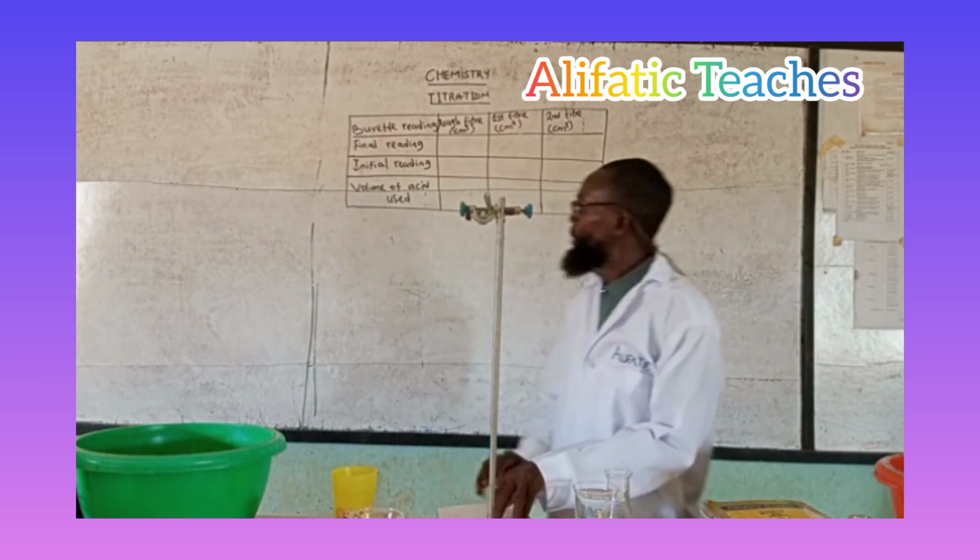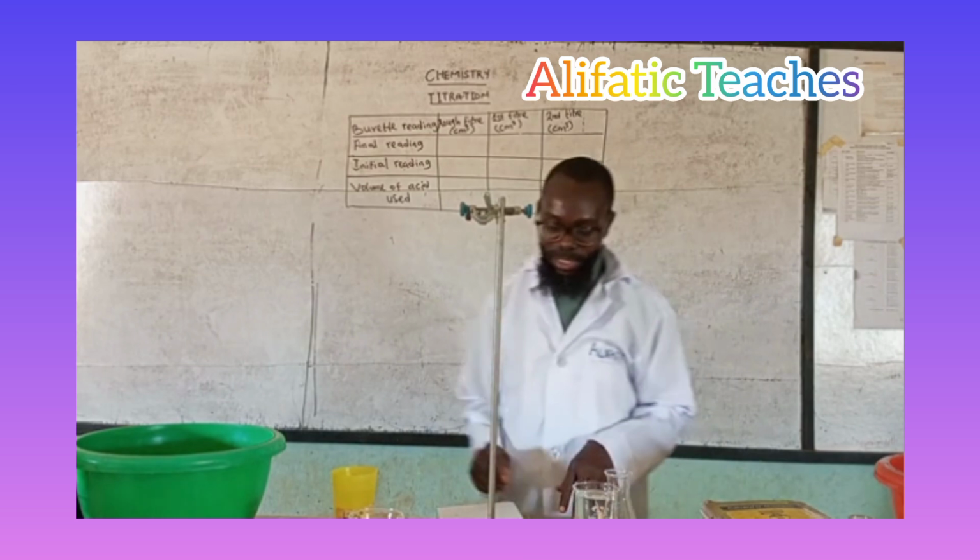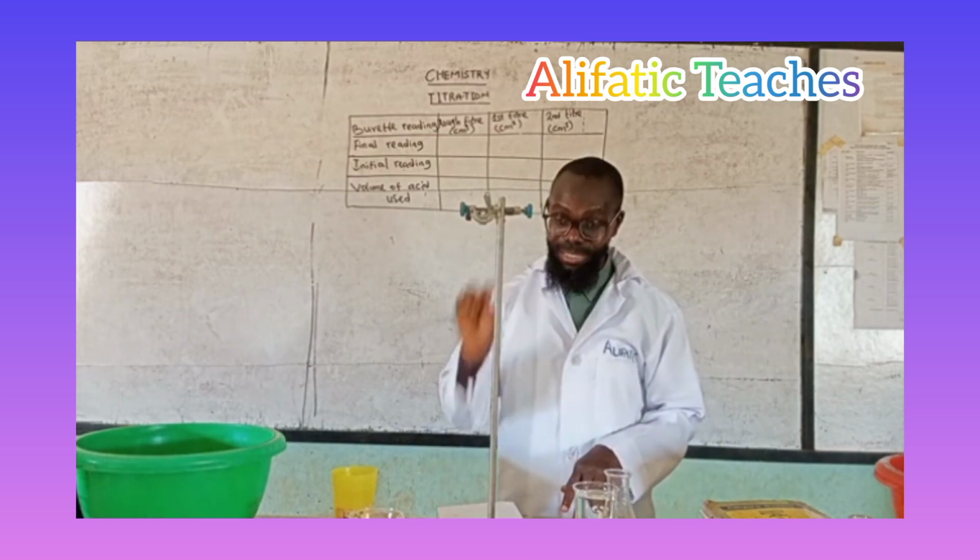In today's class, we are going to continue on our titration. So today is going to be the practical application of our titration.